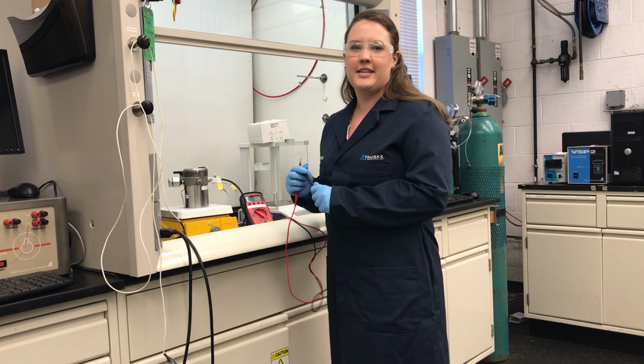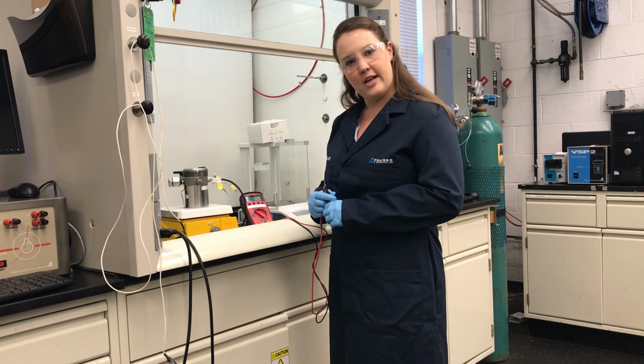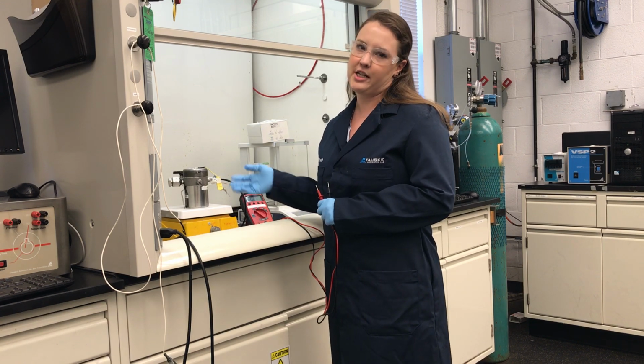Hi, I'm Elizabeth, and I work at Fauske in our thermal hazards lab, and today I'm going to show you the electrical checks for the ARSST.